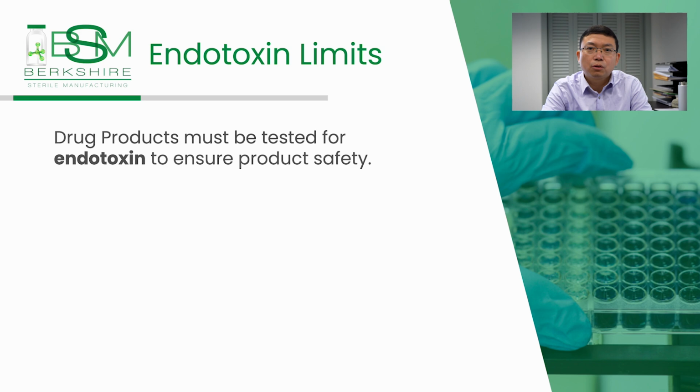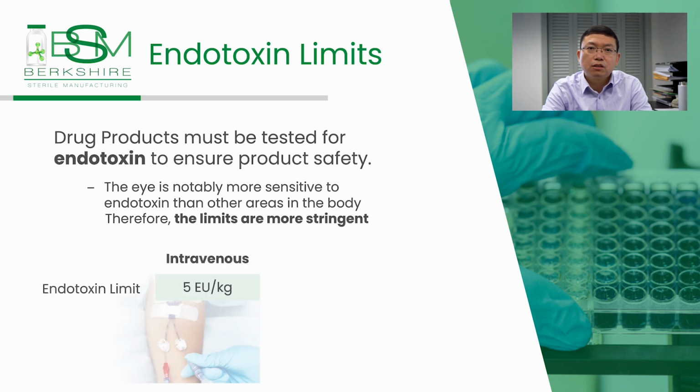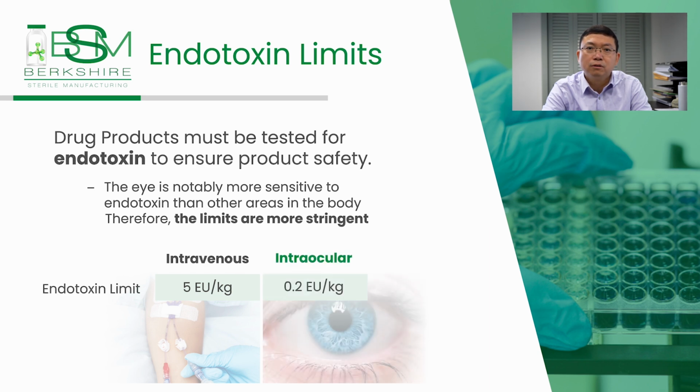Drug products, especially those administered into the eye, must be tested for endotoxins to ensure product safety. The eye is notably more sensitive to endotoxin than most other areas in the body, and so the endotoxin limits for ocular medicines are much more stringent. For intravenous parenteral products, the endotoxin limit is 5 endotoxin units per kilogram of body weight. For intraocular products, however, the limit is 0.2 endotoxin units per kilogram of body weight. This is a difference of 25-fold.